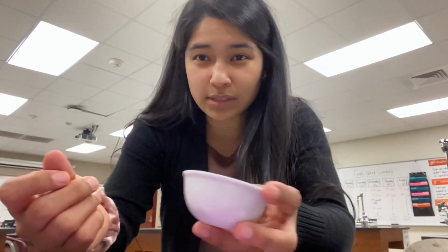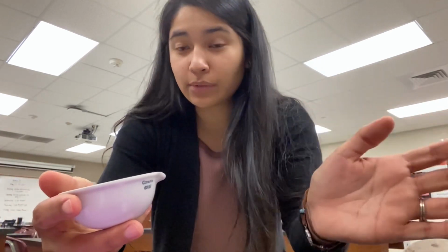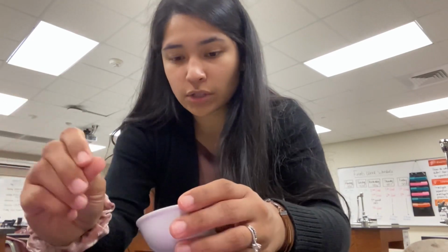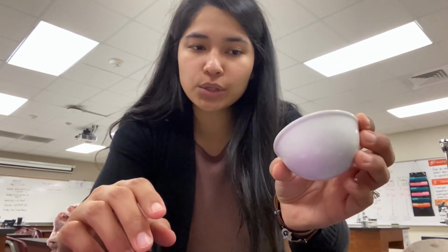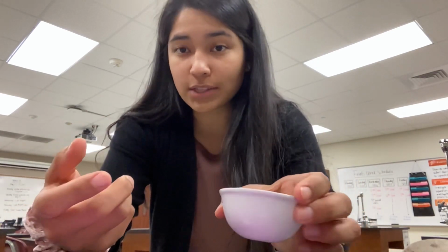You could just dry it out, you could leave it out in the sun, but obviously in the lab we don't want to do that, so you would place it inside of a fume hood, turn on the fume hood, and allow all the water to eventually dry up, right? You could also place it on top of a hot plate to speed up the process so that the sand will dry up faster.